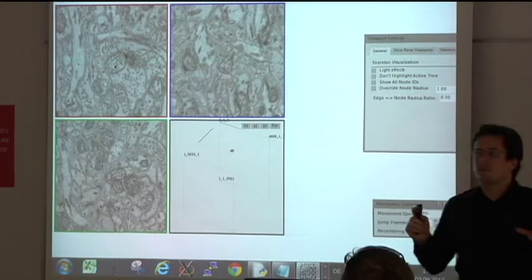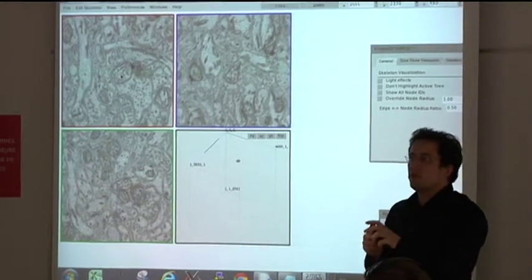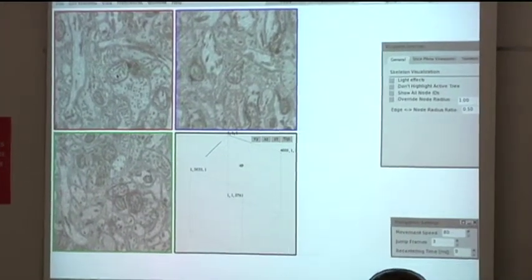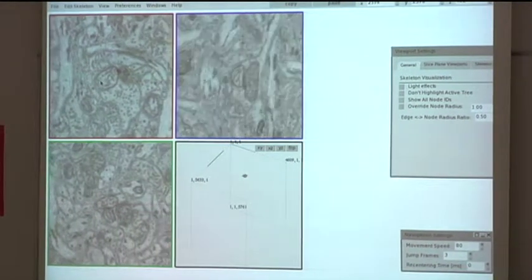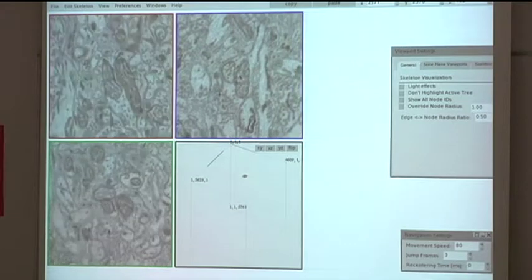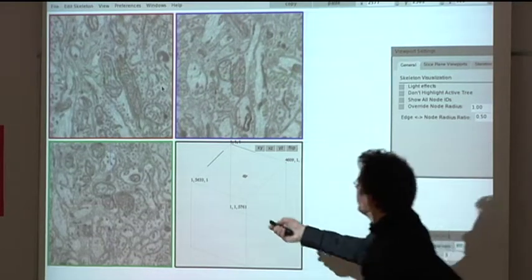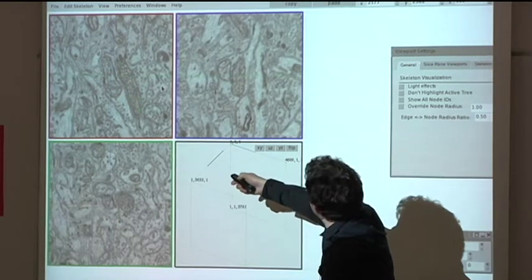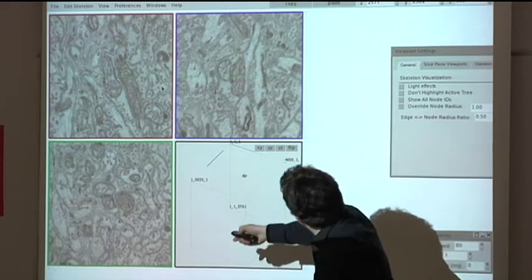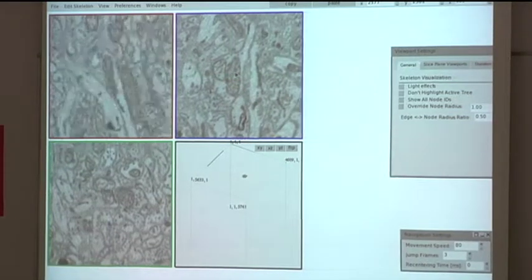Have you seen mitochondrion in textbooks? Yeah. So they are small and kind of ellipsoid. In the brain, they are very complex, long, weird, and because we don't care about them, we don't like them, right? So for circuit reconstruction, we don't want to know about mitochondria, but for instance, this is one. And this entire elongated thing is a mitochondrion. This is the reslice of that one. So they can be really longish, and they sometimes even branch. They're really weird in the brain.